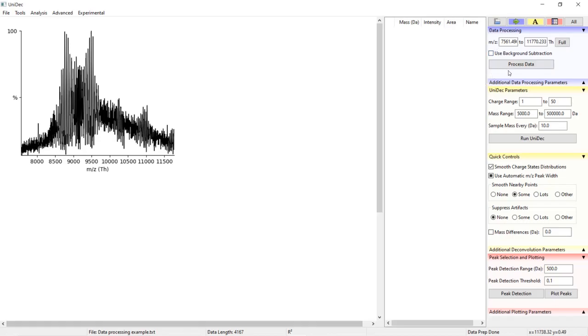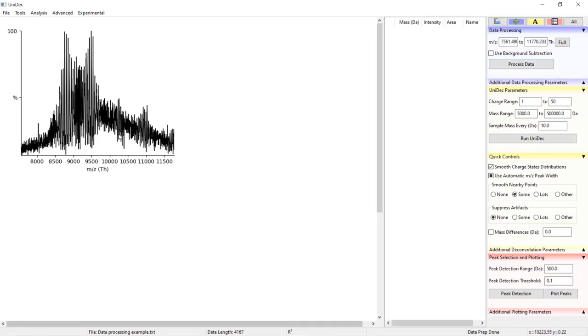Once we've clicked this process data button or right clicked on our spectrum, UniDec creates a file with the processed mass spectrum.